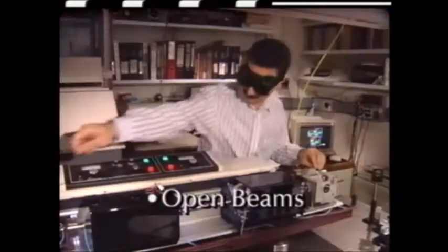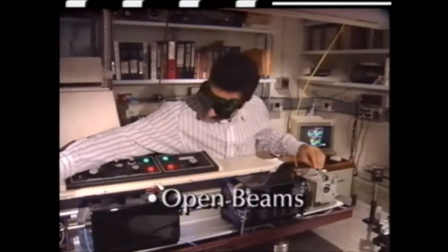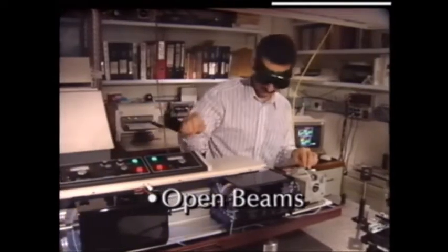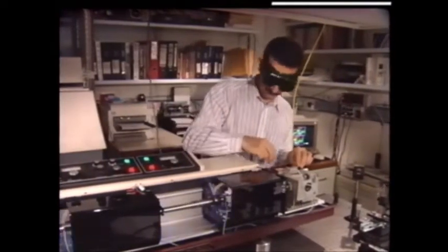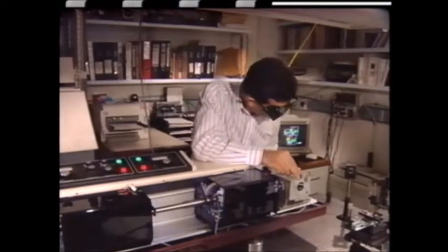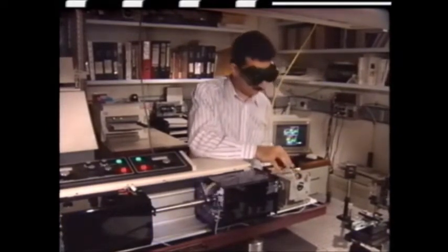Here you'll learn about common laser hazards in the laboratory and ways to minimize the potential for overexposure. An open beam is one that is not totally enclosed. Open beams may be accessed during alignment procedures. There are many other conditions where open beams may occur, but of particular concern is when errant beams are directed into uncontrolled areas.